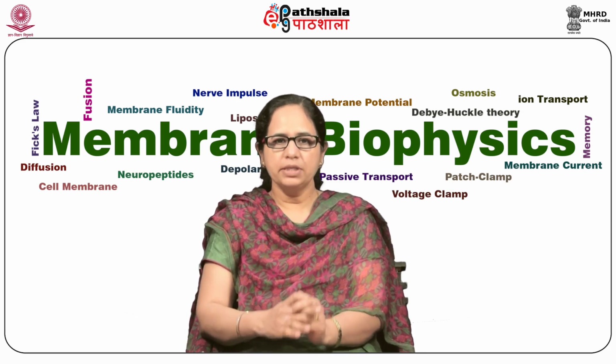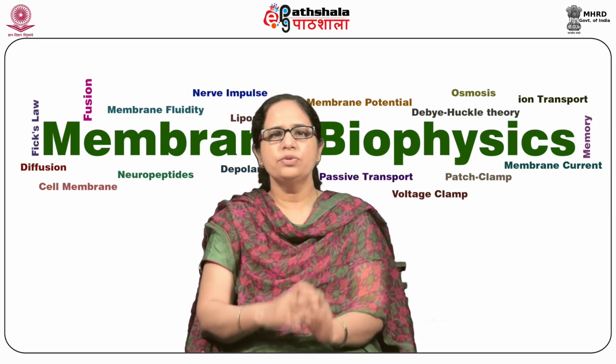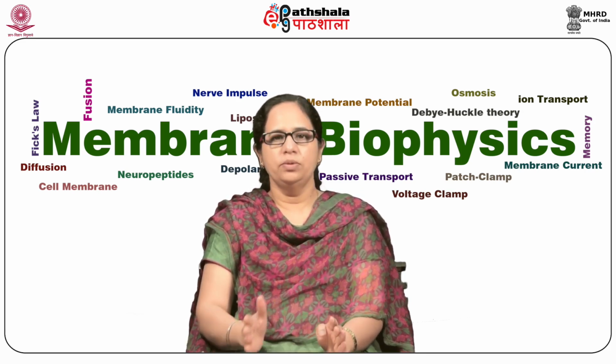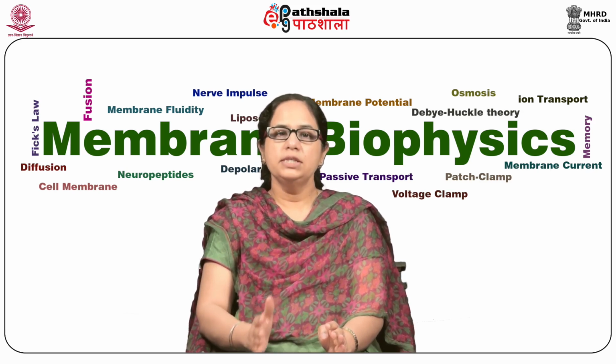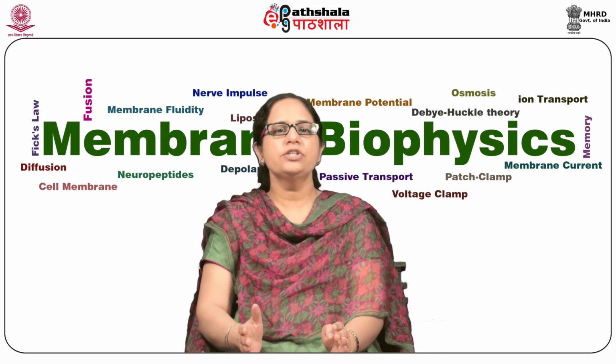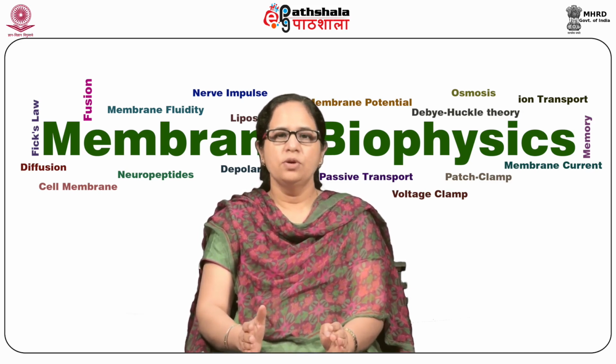Now, applications of the patch clamp or voltage clamp. The patch clamp technique can be used to great effect to help determine the mechanism of action of a compound. This technique is still the gold standard for studying interactions of drug molecules and ion channel receptors or the ion channel itself.